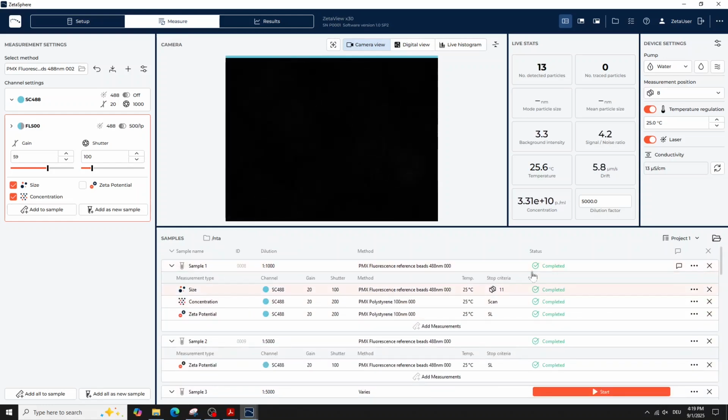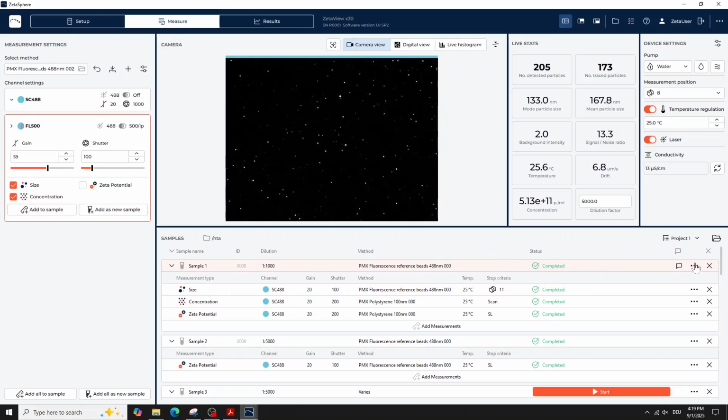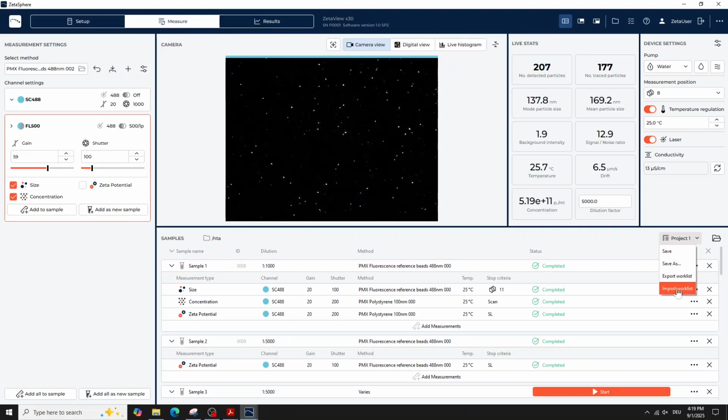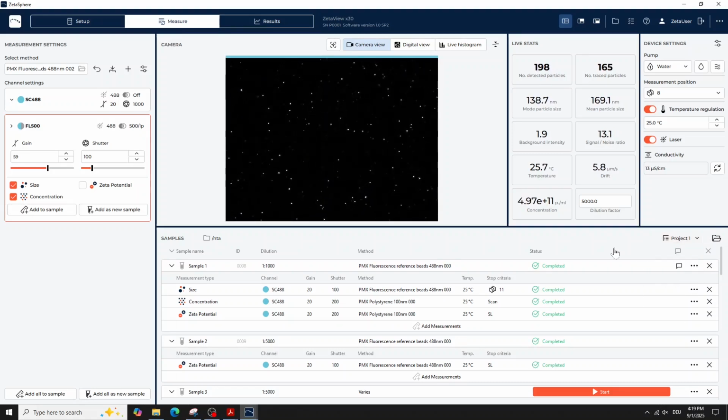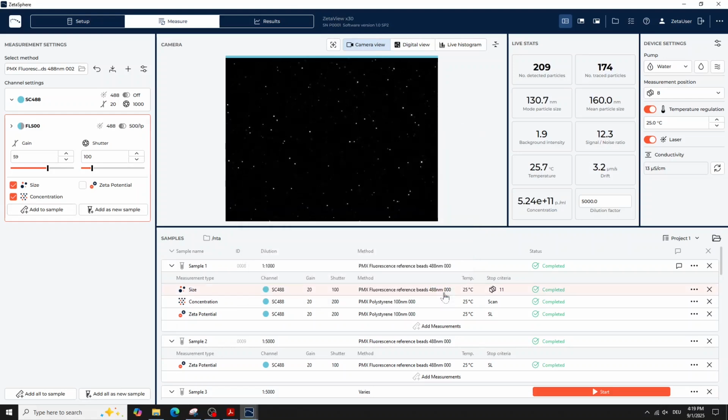Do you have a repetitive daily routine with multiple samples? Simply save, export, or import an entire worklist. You can also create a new worklist revision, perfect for streamlined, repetitive workflows. For a detailed walkthrough of all features, check out our dedicated video.